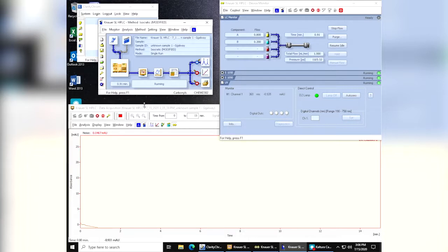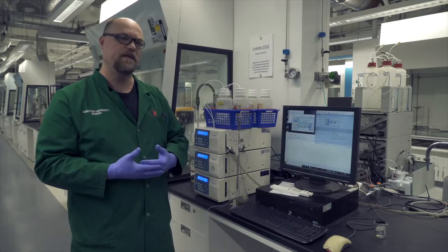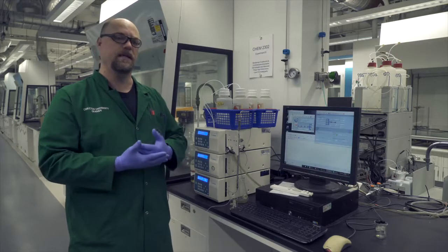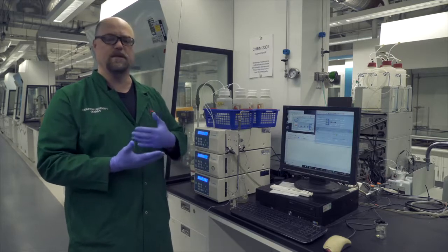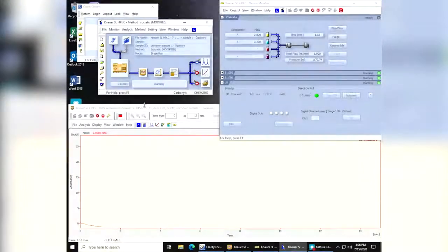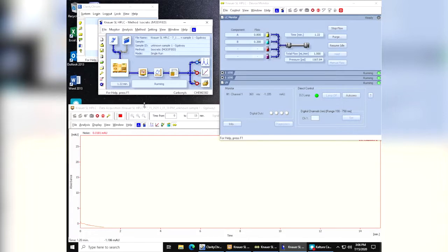When the sample is done, you can consult with your TA to make sure that it is done. They'll help you stop the run. As I said, the run will automatically save, and then you can print it so that you can take a print away with you. So we'll just let this run out on the computer, probably in fast forward, so that the students can see what it looks like.